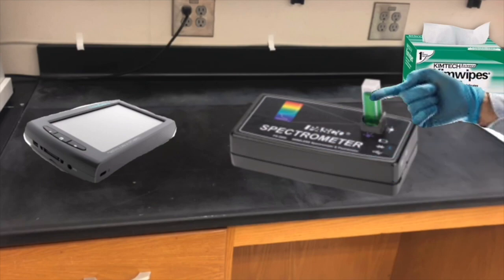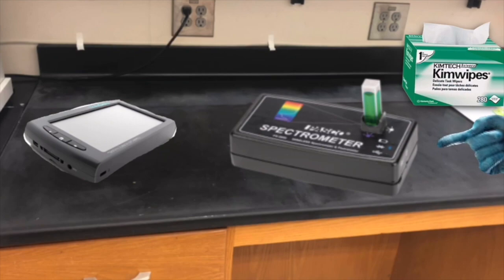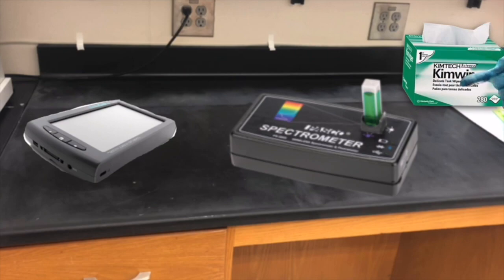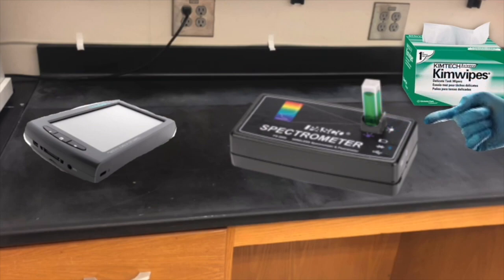Now, before we ran this cuvette through, we actually filled one with just water, which is called a blank. We took it so that we could get rid of any noise or any absorption that wasn't due to the solution itself. Even when we're putting this one in, we have to wipe it down with Kim wipes to get rid of any fingerprints. Otherwise, they could absorb light and mess up the data. As you can tell, this is quite an exact science.